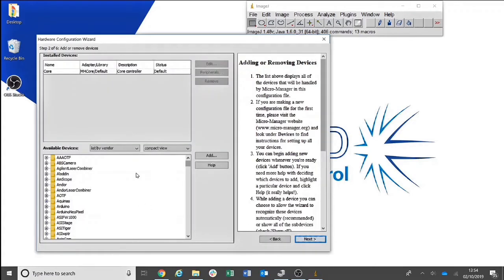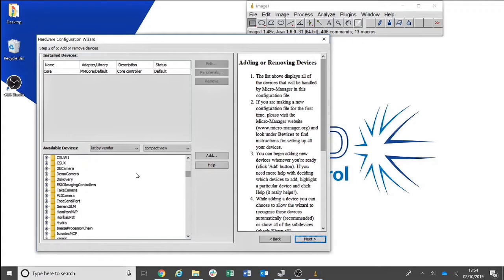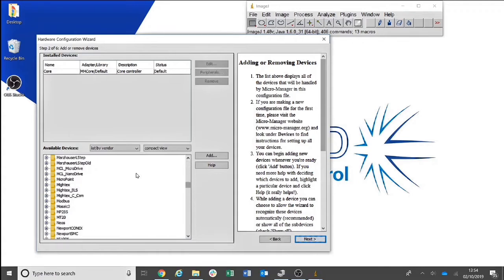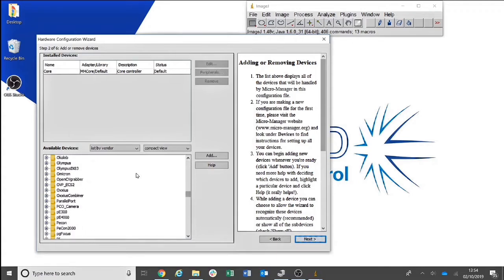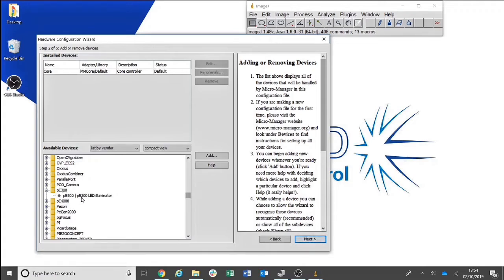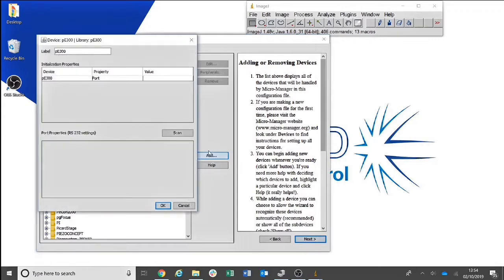Here you will scroll down the list of available devices until you find the correct CoolLED light source. In this case, we will be adding the PE300. Select the light source and click Add.